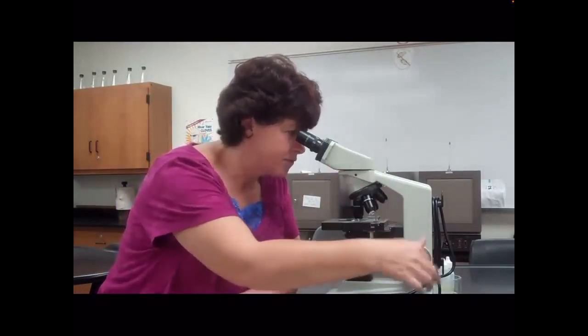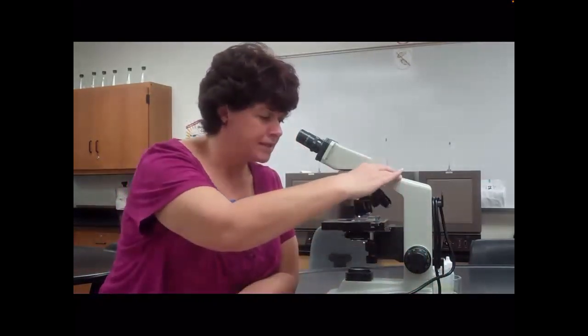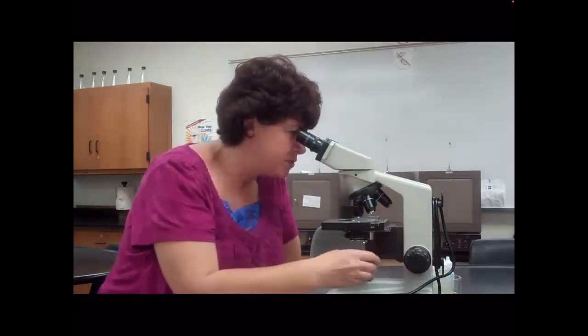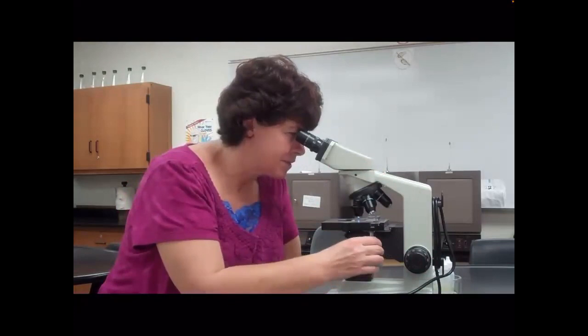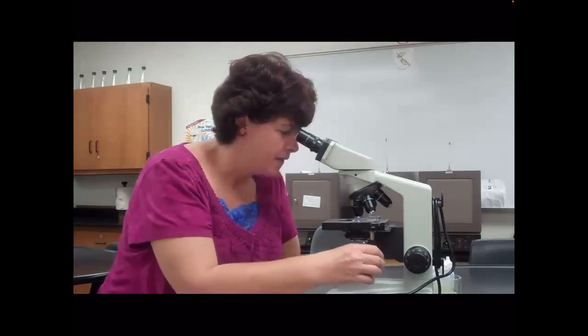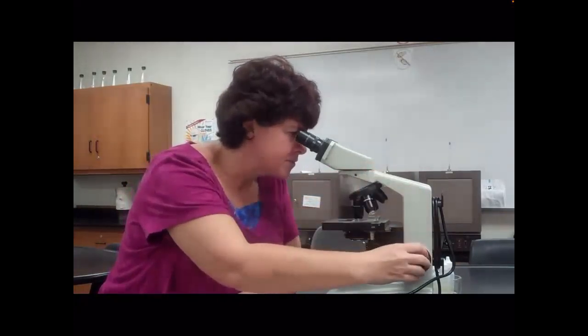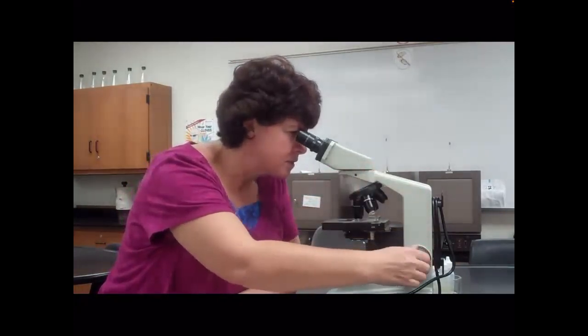If you feel like you're just focusing, take a step back. Go back to the 10, readjust. Some things that can happen is you may not have it centered, okay? Make sure that you're centered right in the middle of the specimen, okay? So now I'm going to go back to the 40. Oh, I see it. It's a little bit blurry, but I see it. So I'm going to focus.